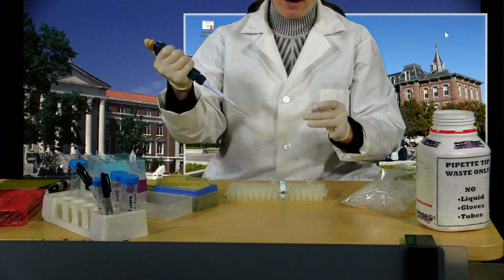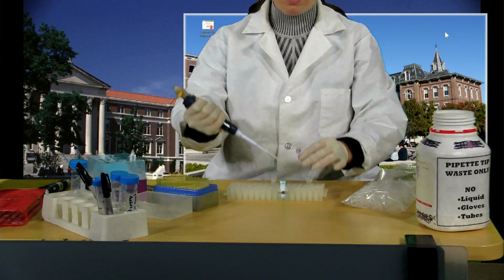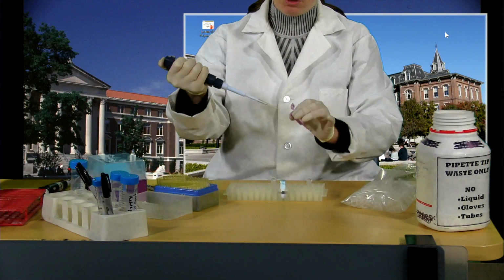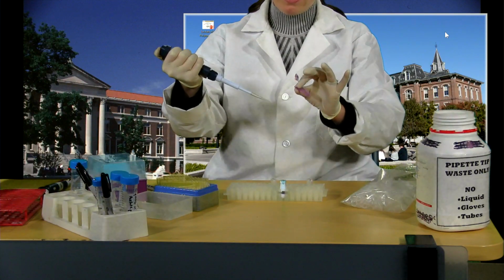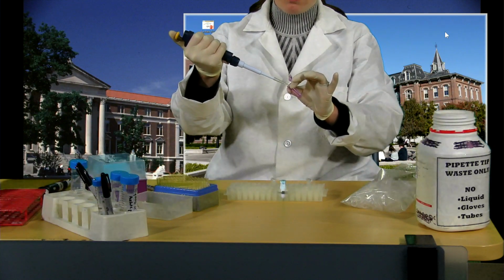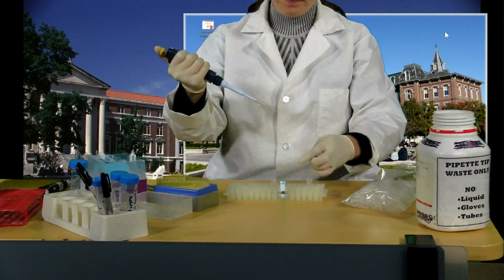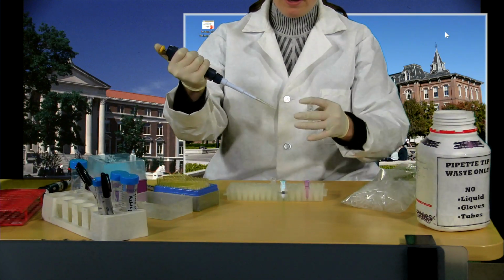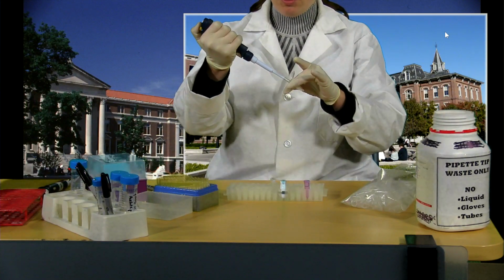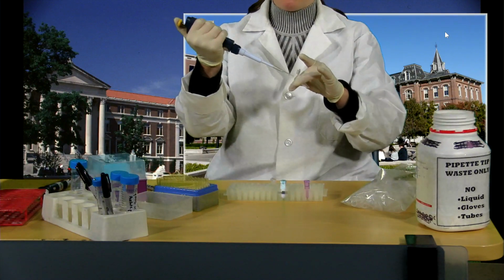And again, remember, as I said in the last video, when you're going to be pipetting, lift up the tubes. Don't be doing this too low, too far away from you, because you won't be able to see accurately what you're pipetting. Try and make the OK sign with your hand here so that you can see through the tube. You're going to pipette 20 microliters, making sure not to totally dunk that tip in there. I'm going to add this directly to the bottom of the tube so that I can see exactly where the 20 microliters is going. Try not to just pipette it loosely into air.